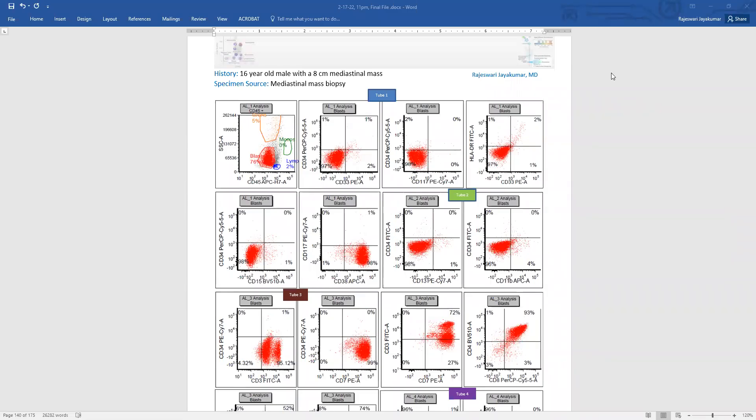Hello everyone. We are now going to go over the flow cytometry from a mediastinal mass biopsy from a 16-year-old male who had an 8 centimeter mediastinal mass, pretty large.